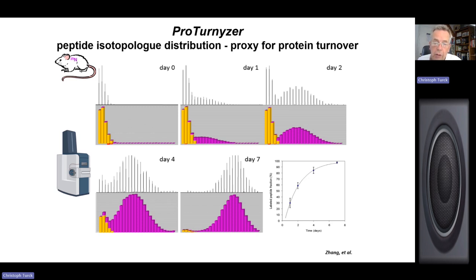And what I'm trying to illustrate here is these yellowish signals that you see. This is unlabeled peptide. And the purple signal is the labeled portion of the peptide. So it's an identical peptide, just with different numbers of 15N. In the beginning, you have almost no 15N, and as you go along from day 1 all the way to day 7, this happens to be a protein with very high turnover. The purple 15N isotopologue signals increase.